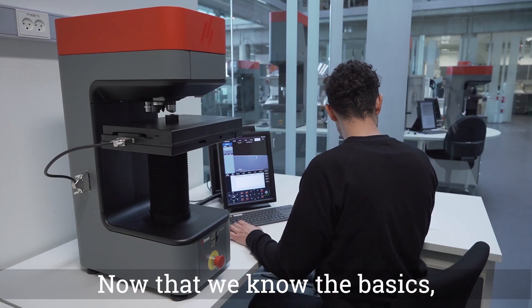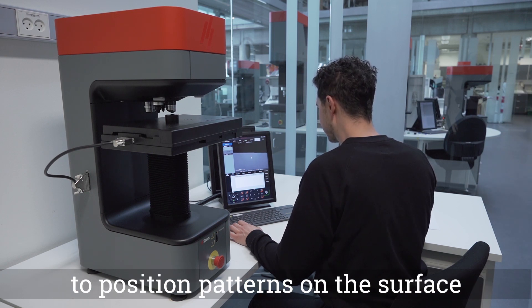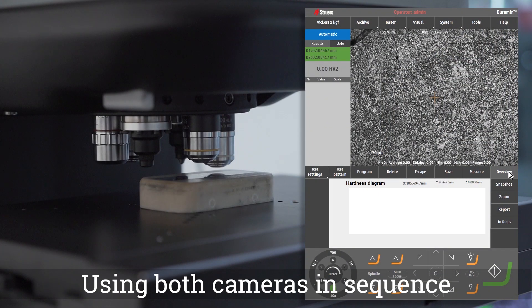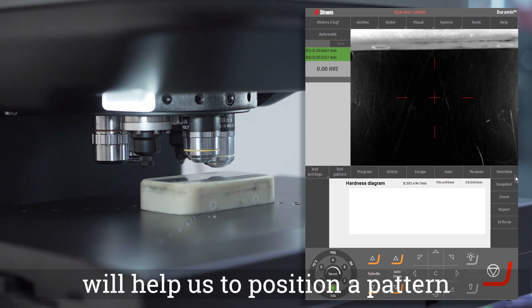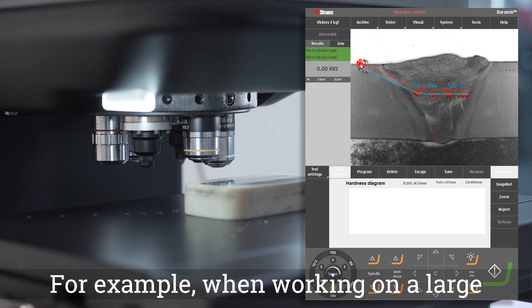Now that we know the basics, let's have a look at 10 interesting methods to position patterns on the surface of a sample. Using overview and objective camera in sequence. Using both cameras in sequence will help us to position a pattern in a quick and effective way.